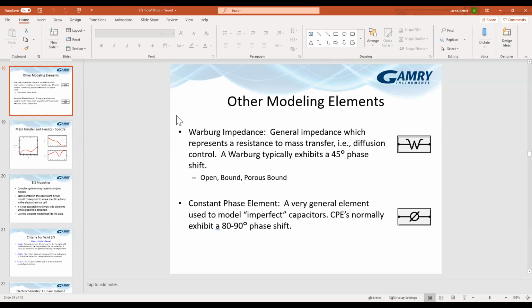That is case by case. The easiest example to say yes to is if you're dealing with making measurements on powered systems, fuel cells, batteries, things like that. And the caution is where is ground in the system. So basically, you can accidentally short a battery or a fuel cell or any other electrode through the potentiostat. It's just that most electrodes aren't capable of generating their own power. They don't drive the system.